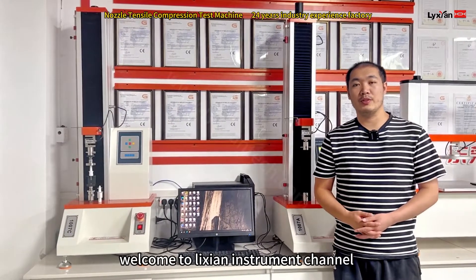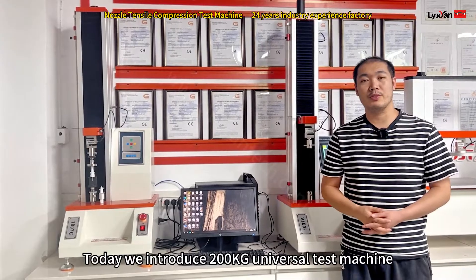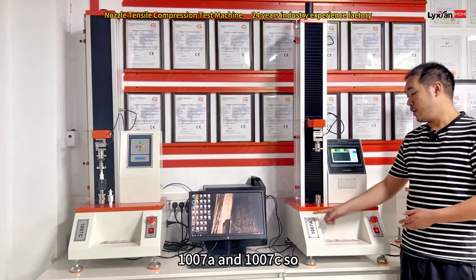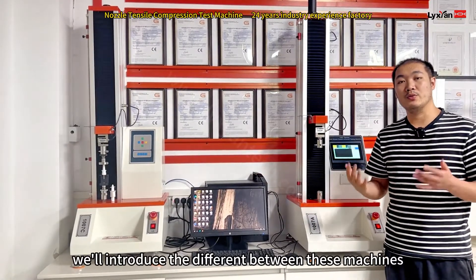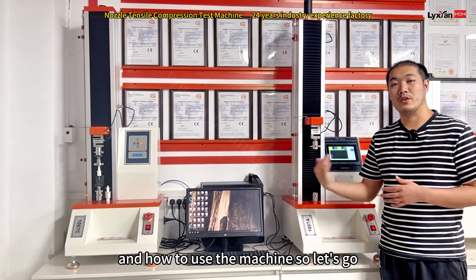Hello everyone, welcome to Lixian Instrument channel. Today we introduce the 200KG universal testing machine. It's the computer type and the touchscreen type, models 1007A and 1007C. We'll introduce the differences between these two machines and how to use them.